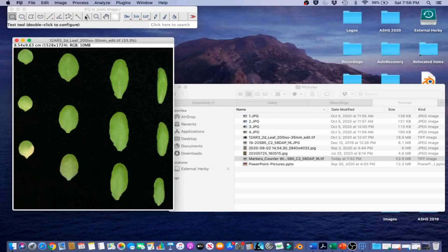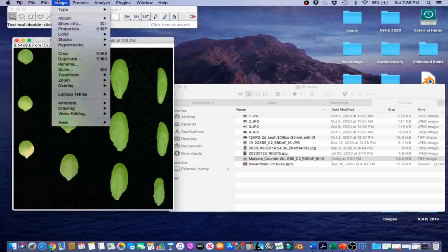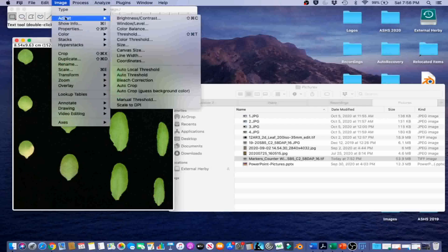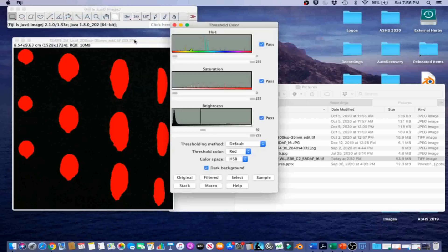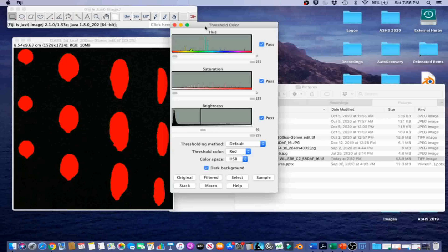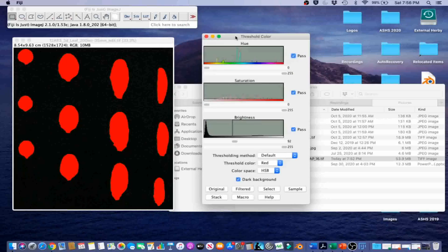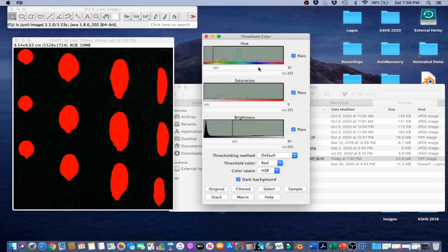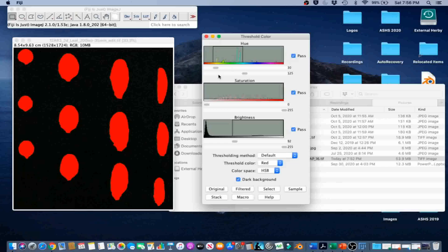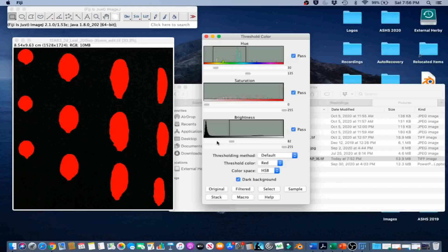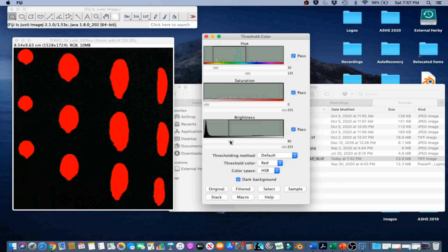Then we are going to go to Image, Adjust, Color Threshold. And we are going to select the leaf area by thresholding. In this image, we are going to need Hue between 30 and 135, Saturation between 0 and 255, and Brightness between 80 and 255. And then we are going to go ahead and click Select.